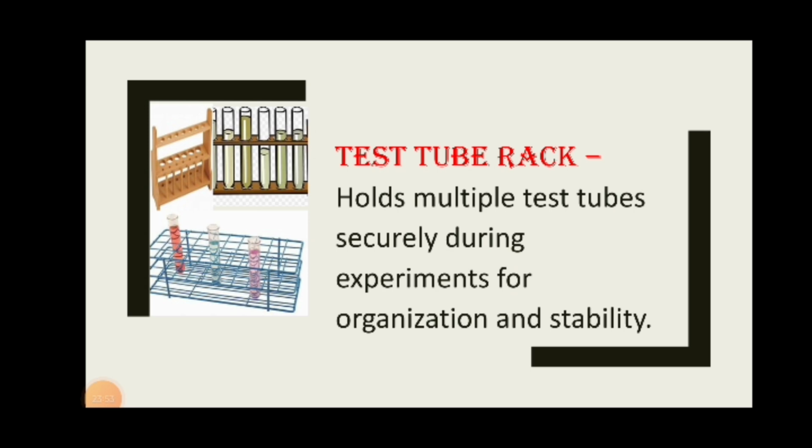For example, test tube rack, by the way, is the next, not the test tube. So test tube rack eventually helps you, aids you to protect your test tubes from breakage, or to put your test tube is to organize so that it will not interchange, no? So test tube rack would help you in organizing your experiment.